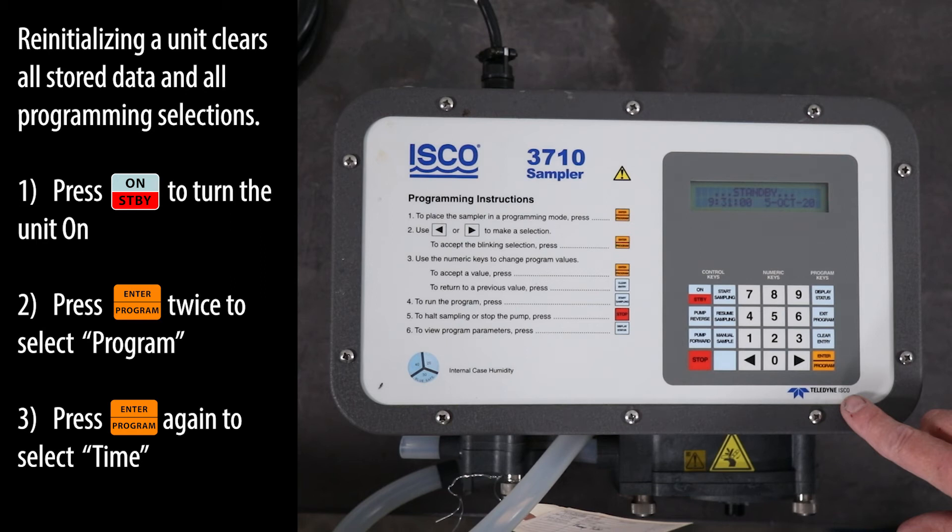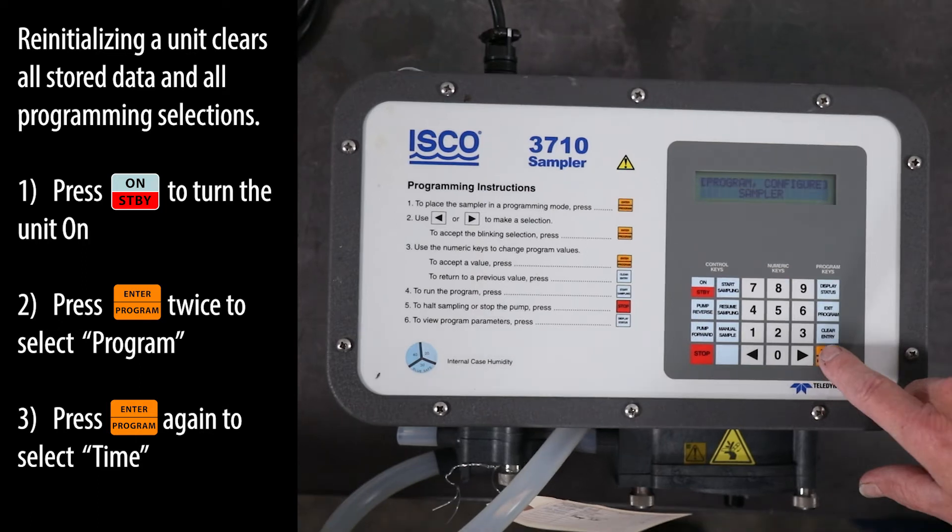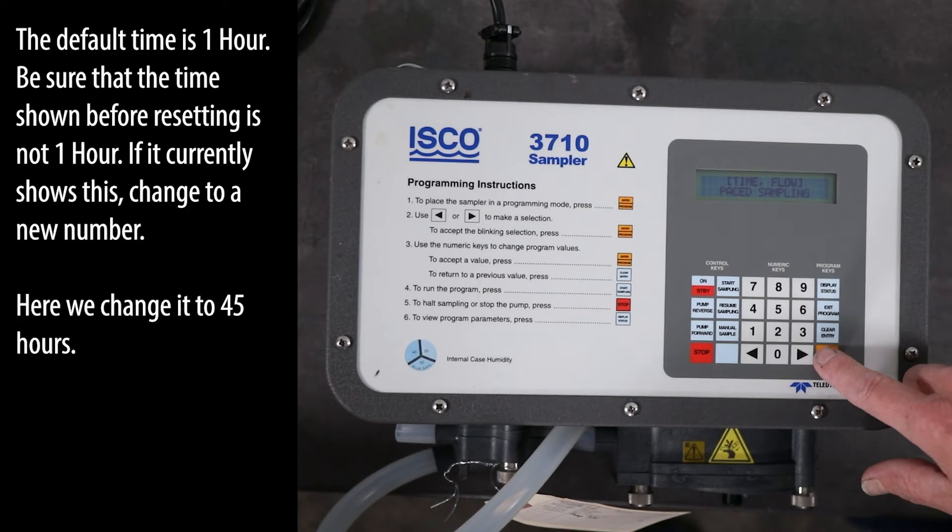Re-initializing a unit clears all stored data and all programming selections. Press the ON standby key to turn the unit on. Press the ENTER program key twice to select program. Press the ENTER program key again to select time. The default time is one hour.